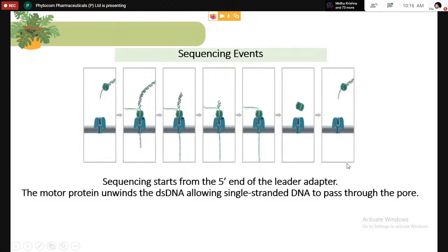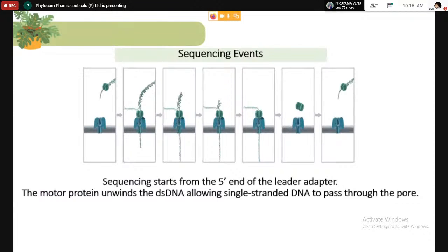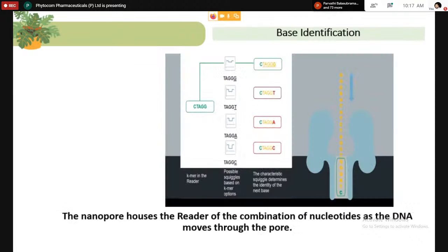And the other strand also will be passing through it when the adapter binds to the other 5' end. So from different fragments, you can get a greater number of reads. So that is how the sequencing event takes place in the nanopore process. So they have made it in such a way.